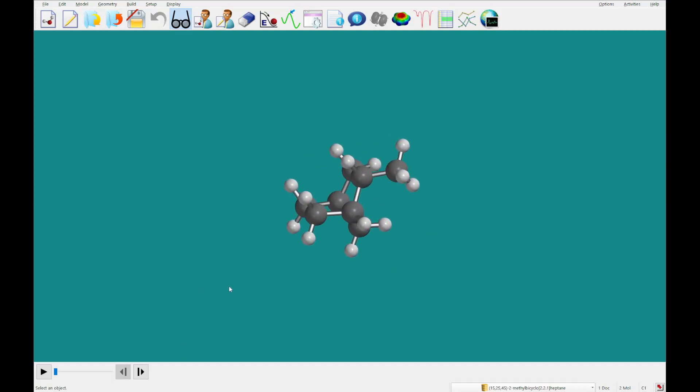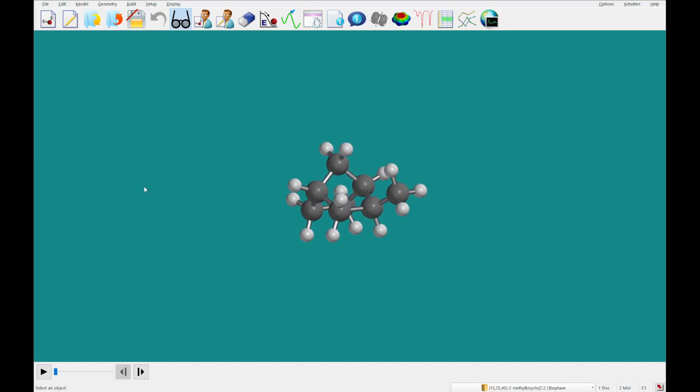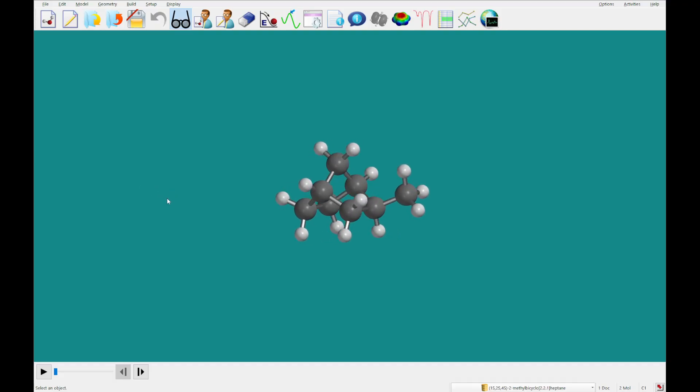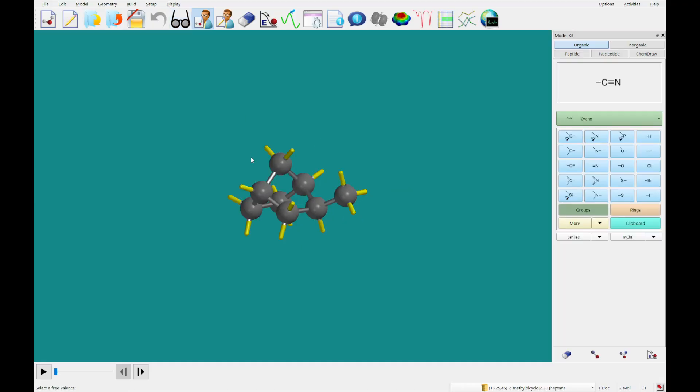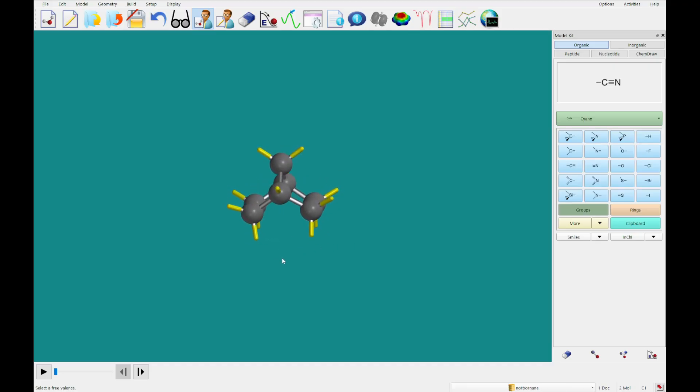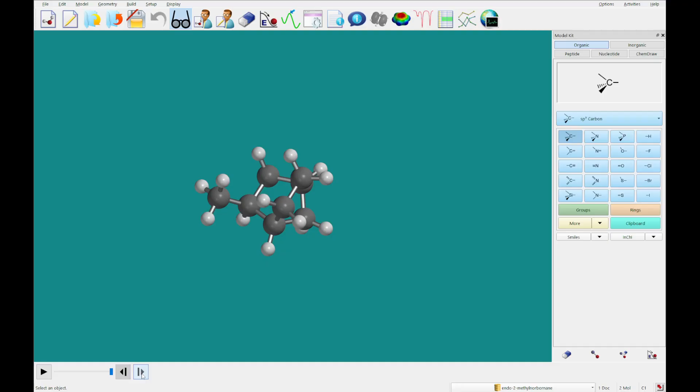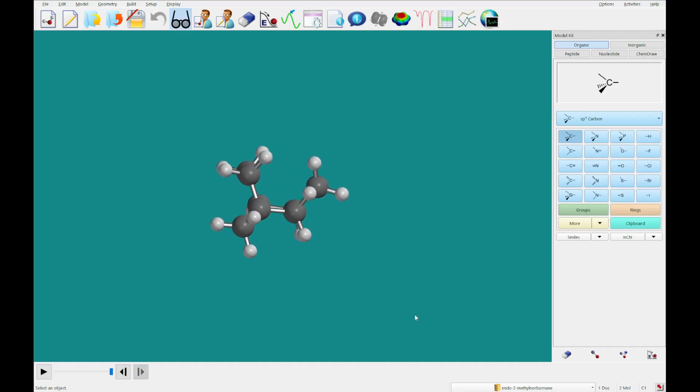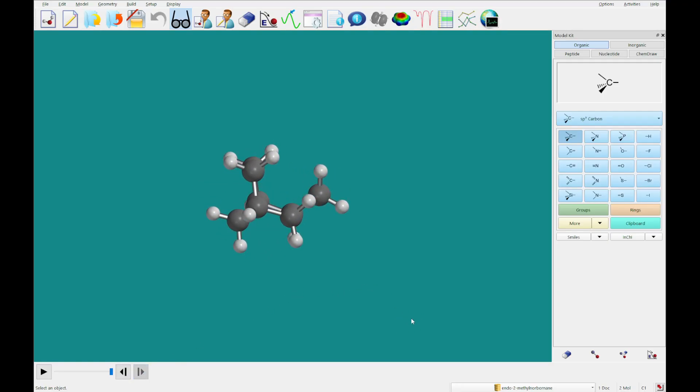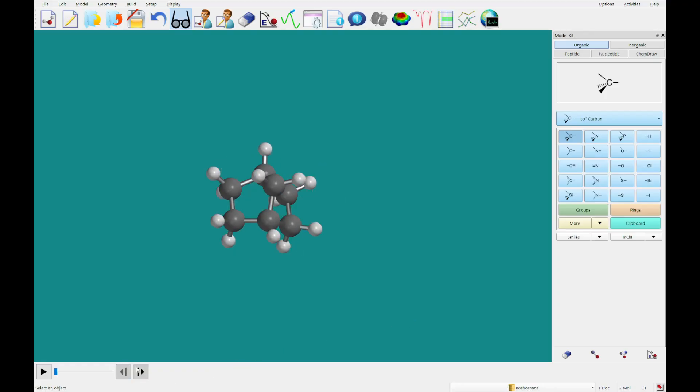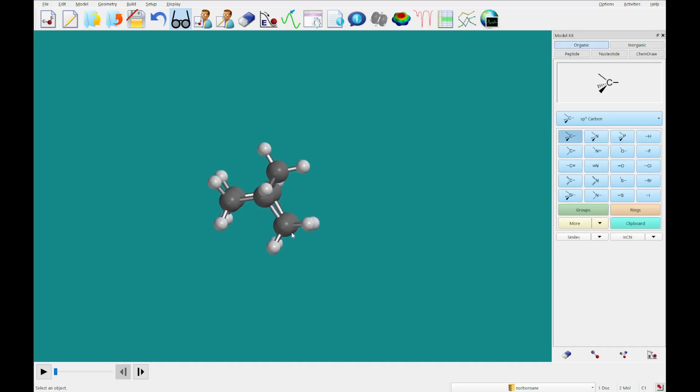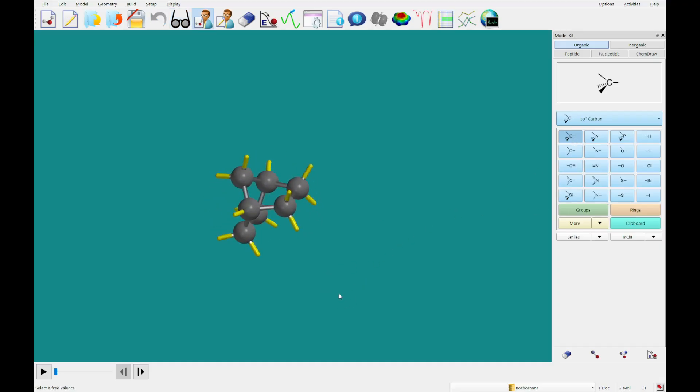It seems that that didn't go properly. So what I'm going to do here is use the 3D builder to fix it. I'm holding the delete key and deleting this. We've got our norboronane. I'm going to add our methyl carbon. Let's check again. So this one, alright, looks like we've got the endo. So we need to add the exo.